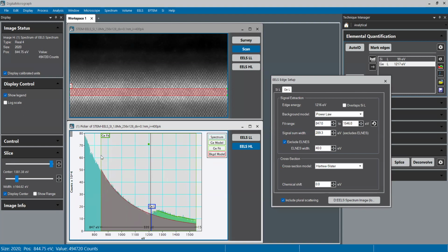And same thing here. So I'm going to drag this window a little closer. Now you can see what's happening here, right? I'm getting more germanium when I make the background window a little smaller, okay? So, but it looks like to me anyway. Now, if you mess this up, just hit the arrow here, the cycle, and that will put it back, okay? But it looks like this is a better fit to me if I make this a little bit smaller, okay? So we'll leave that there.